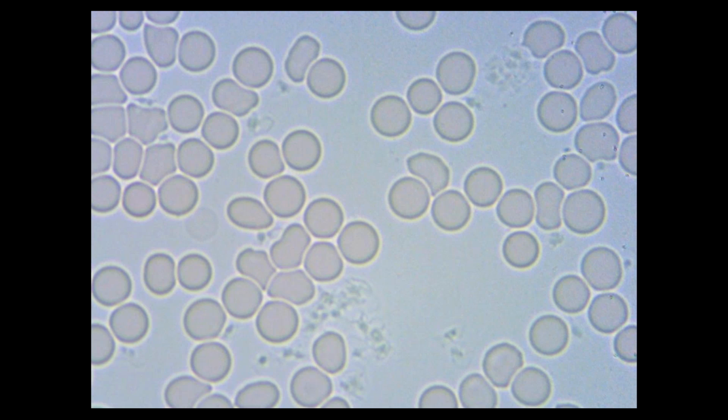In a good state, yeah, that's quite an important question. It also varies from supplier to supplier. A very important question would be to ask about the sort of warranty period. So on the microscopes that we supply, there's a 2-year warranty on it. And generally, because all the components are closed off within the microscope itself, there really isn't much need for maintenance as such on the microscope, as long as you're covering the microscope with the dust cover that's supplied after use to protect it from dust. There really isn't much else that needs to be done.